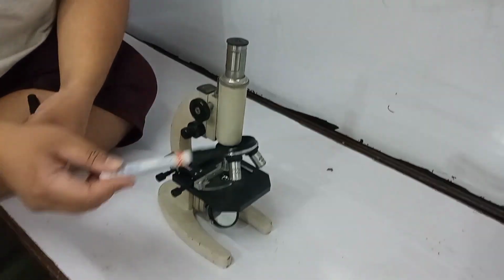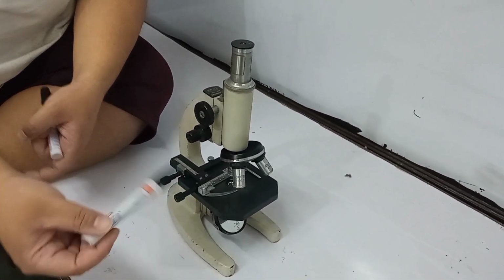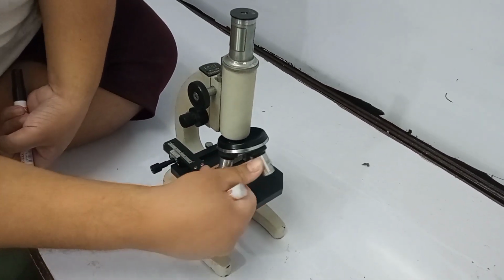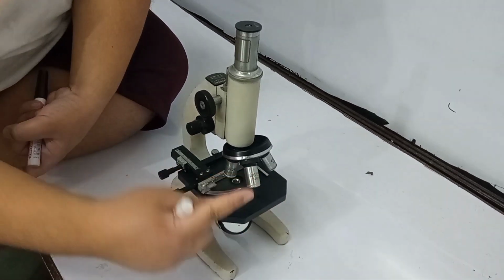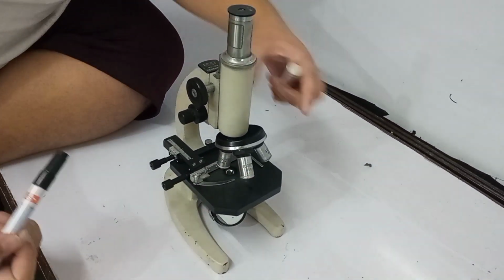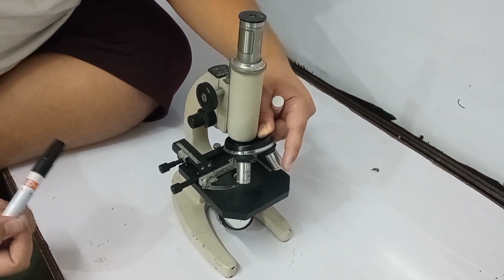The nose piece holds the three objectives. You have there the shortest, low power objective, and then when you roll it, maririnig mo siya, click.